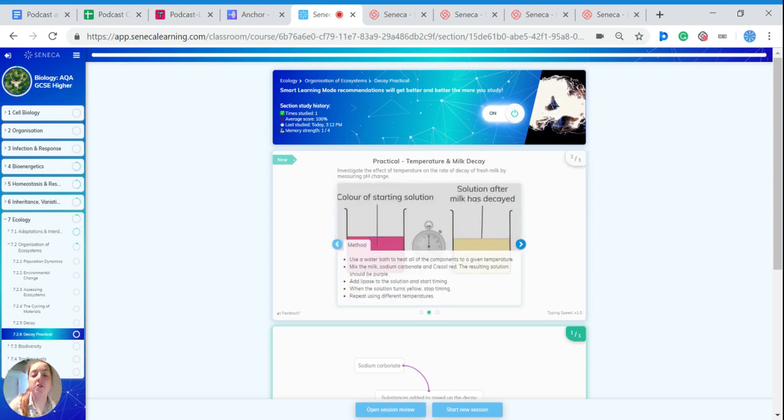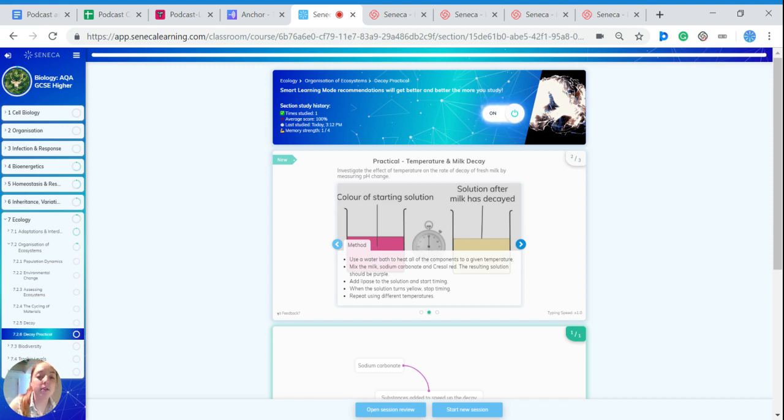So the method. We're going to use a water bath to heat all of the components at a given temperature. Mix the milk, sodium carbonate and Cresol red together and this produces a solution which is purple.